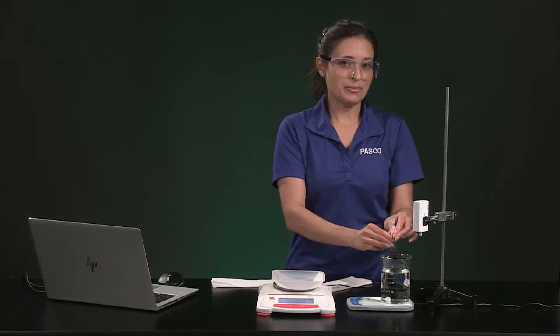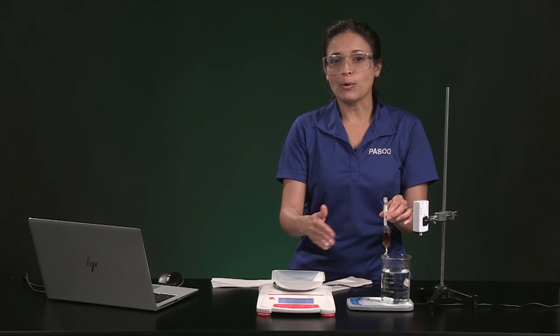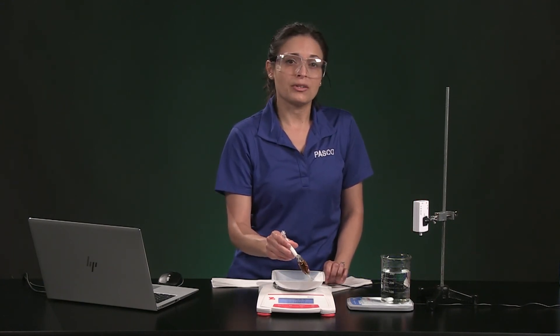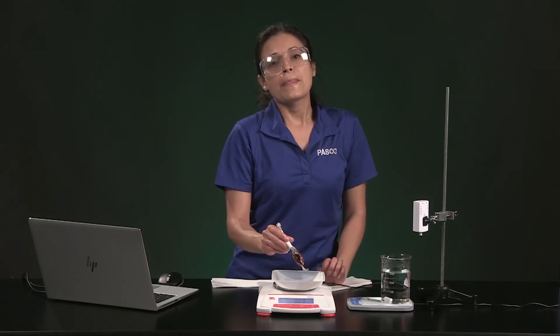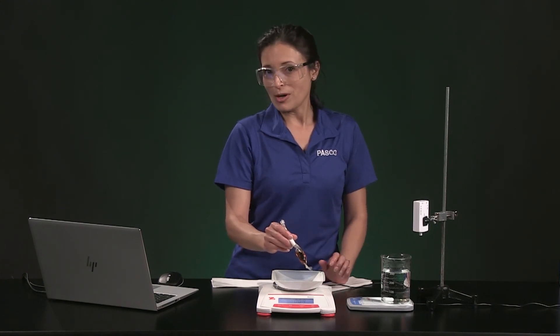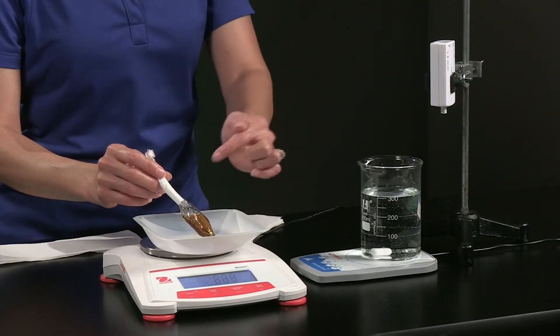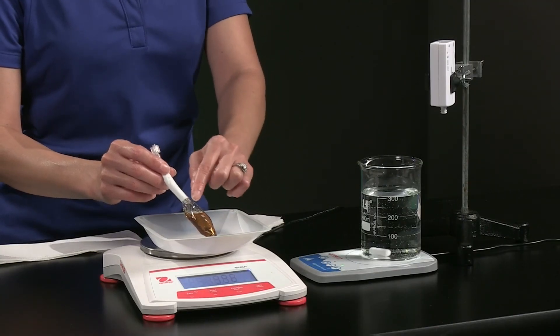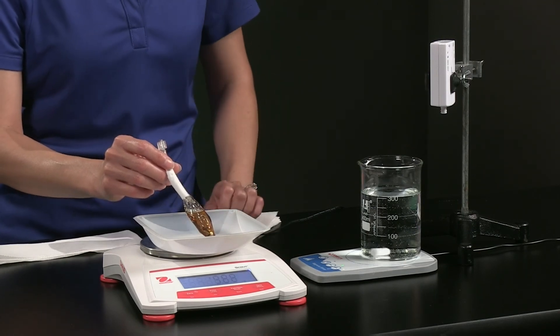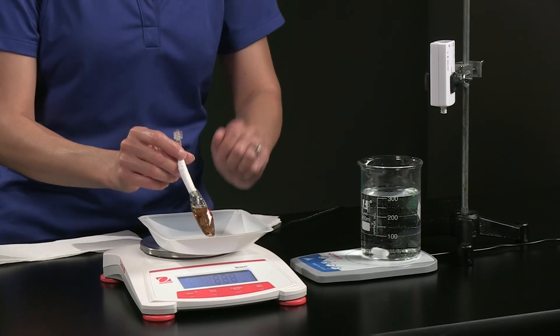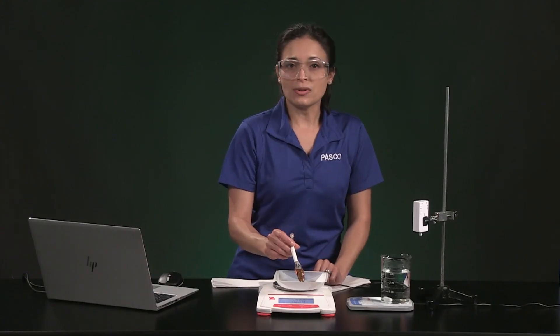When I put the bag in the beaker, water will move back and forth through the membrane but the pressure sensor will help us understand which direction water is moving overall. That is what I am going to call the net movement of water. If water has a net movement into the bag, that air space will shrink and the pressure will increase. If water has a net movement out of the bag, the air space will get bigger and pressure will decrease.